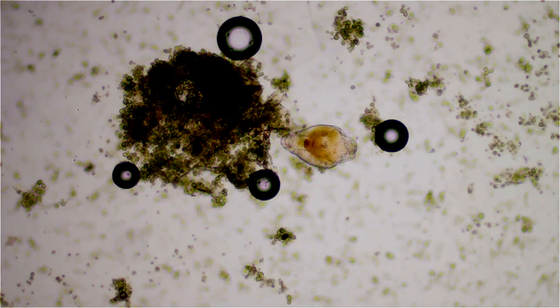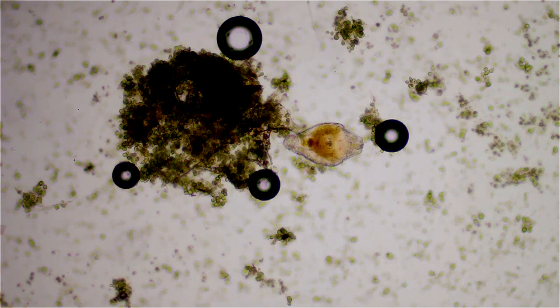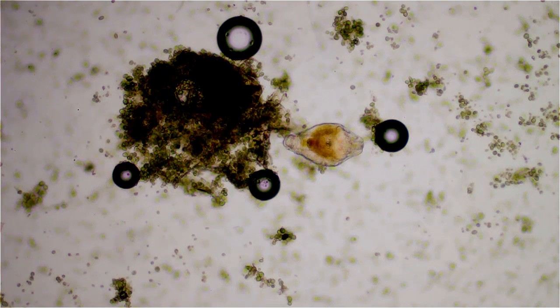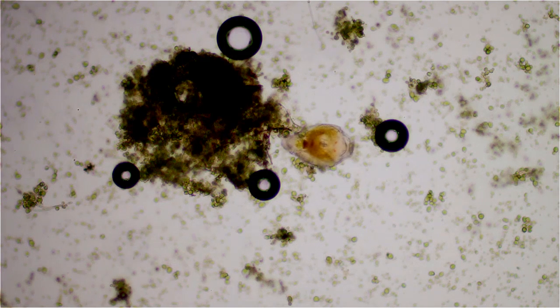Actually, this whole movie is just a test. Here's a 10x shot just to give you an idea of scale. This is also a Nikon DL phase lens, but using bright field, and we're coming up on the end of the movie.